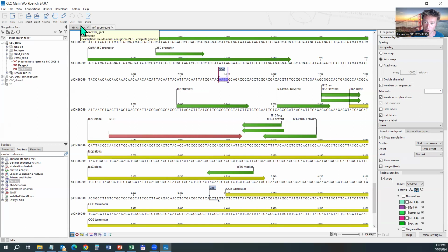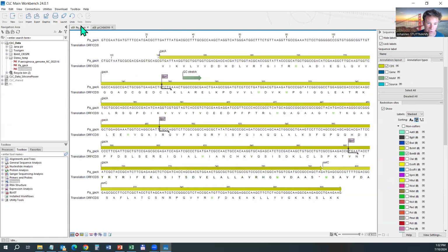Normally in plants, well, in eukaryotes, we only have ATG as a start codon, but in bacteria, you have several ones. So now we would have to decide whether we want to add an additional methionine upstream of the initiating valine that is coming from the bacterial genome, or whether we change the valine into methionine for the plant expression. This is what I actually would do. So I would replace this codon by an ATG. So now we have a methionine, and this will be cleaved off anyways in the plant.